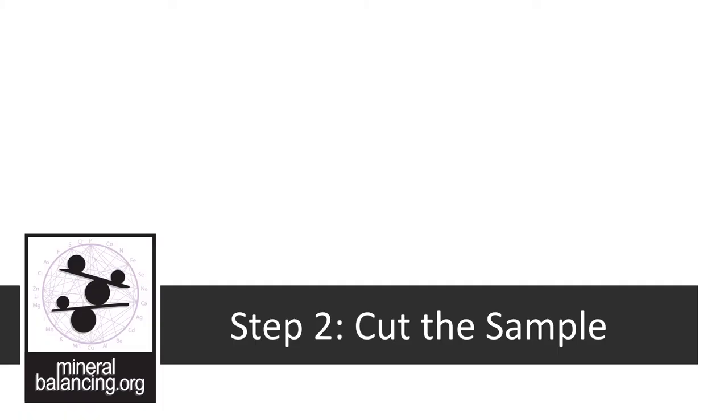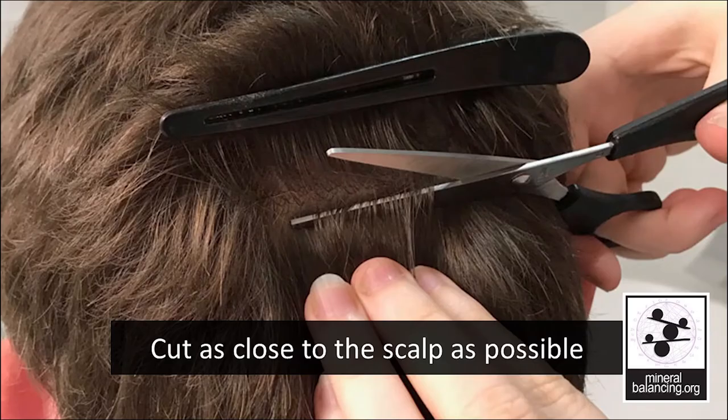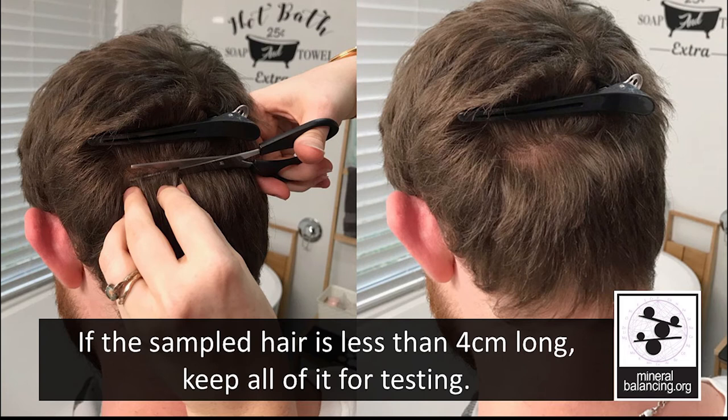Now that we've prepared the hair, washed it, and it's completely dry, and we know where we're going to cut, we're ready for step two: cutting the sample. You can use a clip to hold the hair in place so that you can see your sample area more clearly, or have the person hold their own hair out of the way. Cut the sample as close to the scalp as possible, in thin lines from the sample areas — about four centimeters across and half a centimeter wide — as this will avoid obvious bald spots. Be sure you are holding the hair that is being cut so that it doesn't fall on the ground. This is a before and after shot; as you can see, there isn't a huge bald spot using this method.